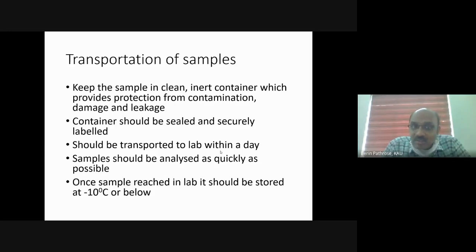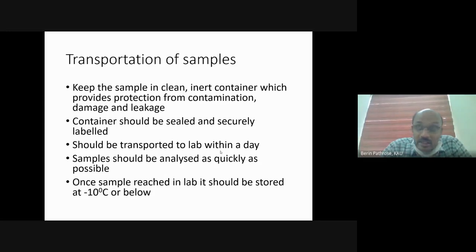The samples should be transported in a clean, inert container, and that container should prevent any chance of leakage, damage, or contamination. So it should be a perfect container, and that container should protect the sample from any damage, contamination and leakage.